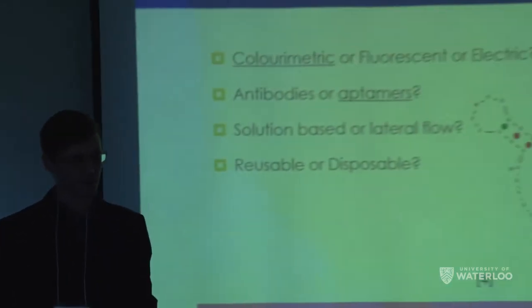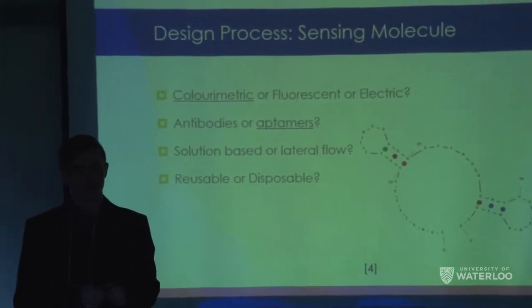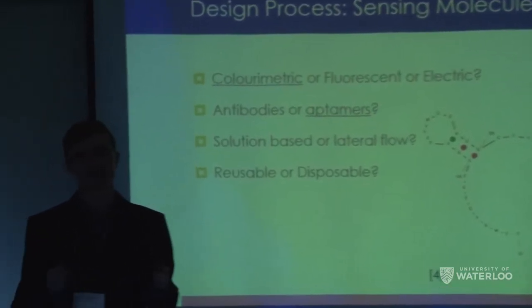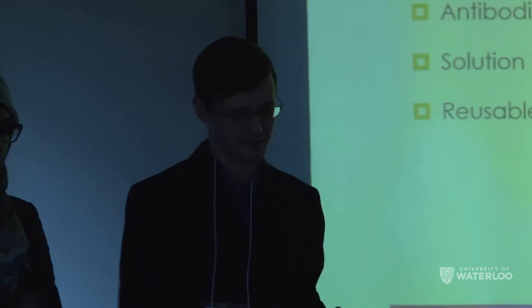For our sensing molecule, we chose aptamers, because aptamers are cheap and easy to find. Antibodies tend to be fairly expensive, and they're very difficult to make on your own because you need to ensure the correct post-translational modifications occur. Those don't occur in bacteria, so you can't just grow them in E. coli.